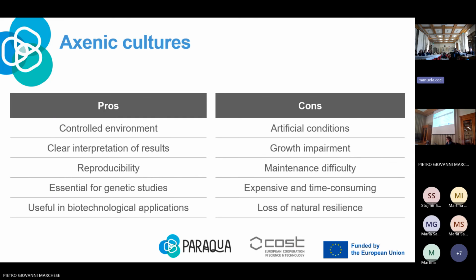But we should know that the elimination of the heterotrophic bacteria, some contaminations, can affect the culture condition, the growth of our target organisms, the cyanobacteria, and some strains can exhibit very weak growth if they are free of microbiota, additional microbiota.